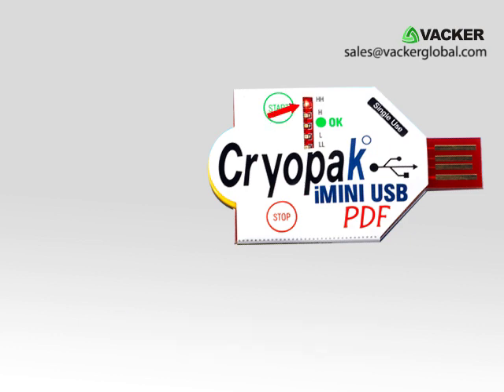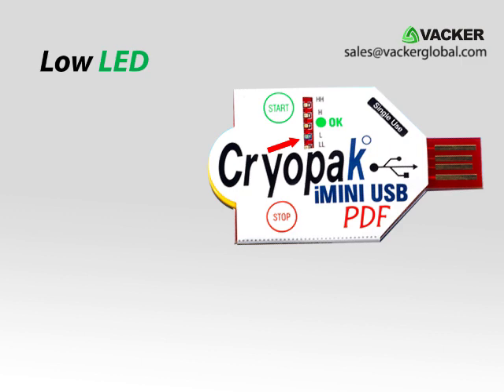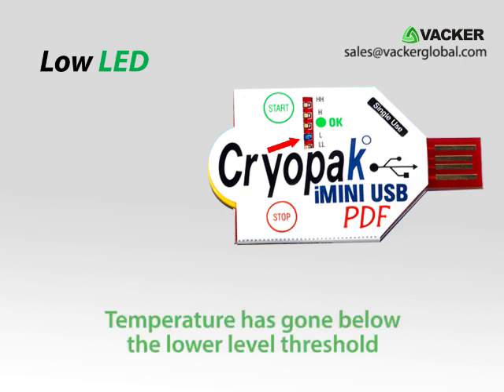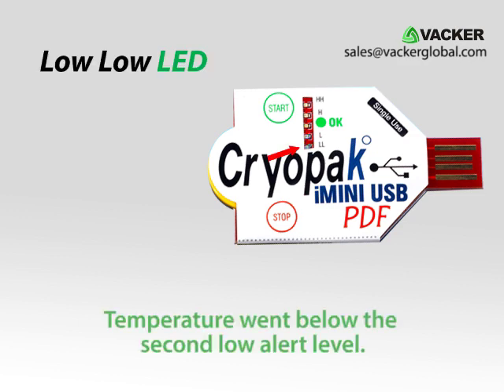There are two red LEDs. If the second one also blinks it means that the temperature exceeded the second upper level. Similarly, the blue LED indicates that the temperature has gone below the lower level threshold. If both blue LEDs are active, it means the temperature has gone below both lower levels.